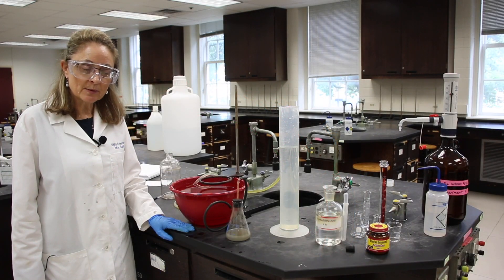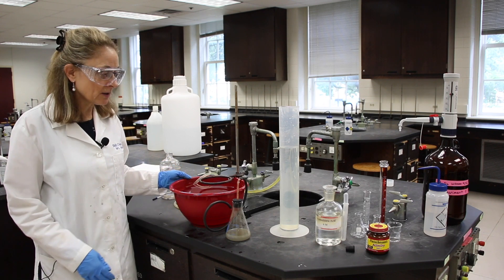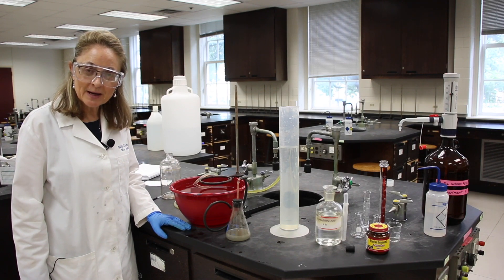Now that we're done with the experiment, we need to clean up. Everything can go to waste here, and put all the equipment in the center so that it's ready for the next group. Thank you for being my lab partner.